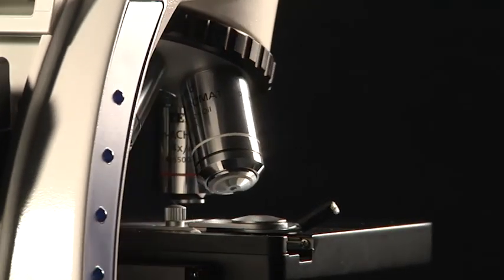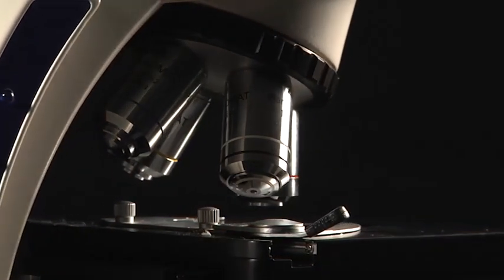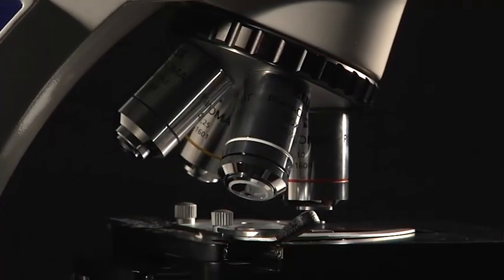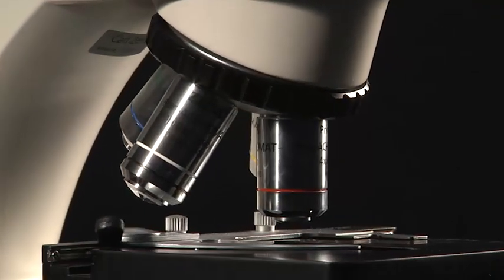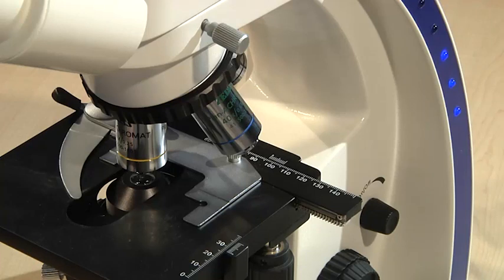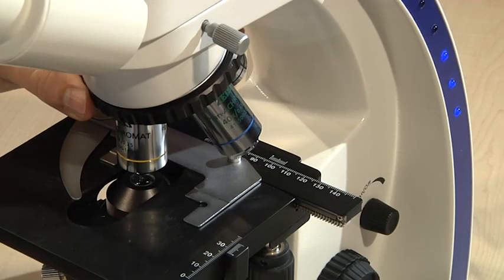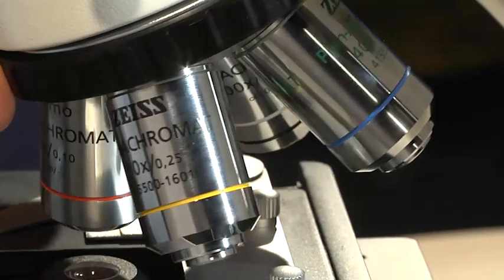An objective is the heart of the light microscope. Four objectives, with magnifications between four times and a hundred times, are mounted on a turret. Here, the primary image is formed, which makes the quality of the lenses crucial for the quality of the final image.